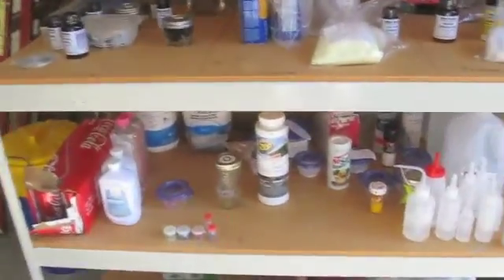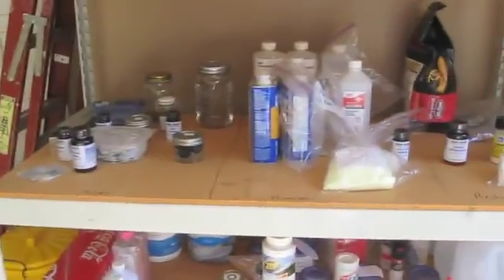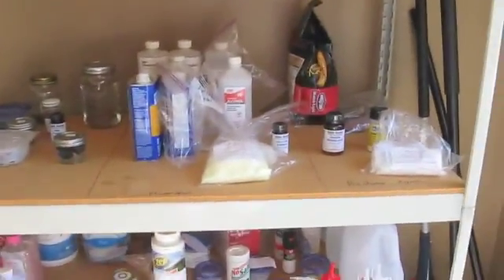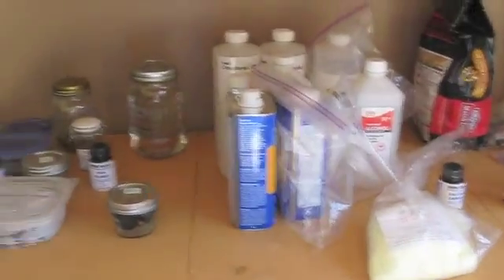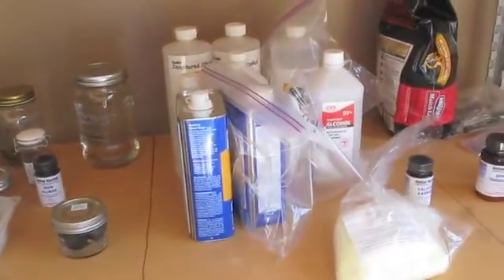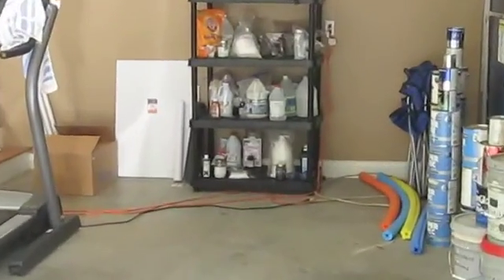You'll see that everything is a lot cleaner than my original video where I gave a lab tour, and I've managed to clean everything up and organize all my chemicals by type without getting rid of any chemicals — and I've actually bought more. I did that by going to Sam's and getting another set of shelving, which I'll talk about later. That's allowed me to organize everything much more effectively.